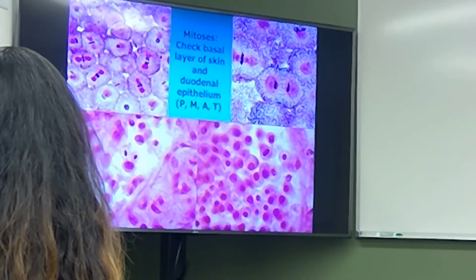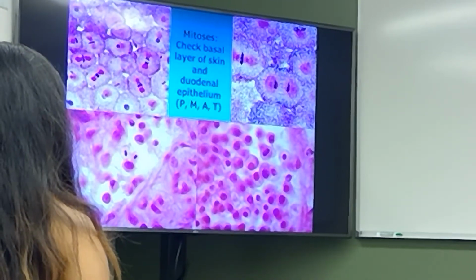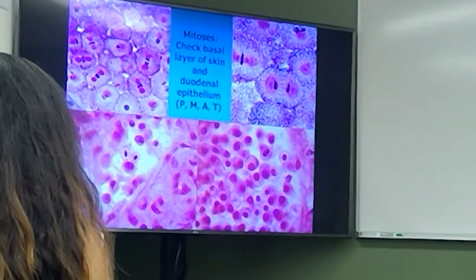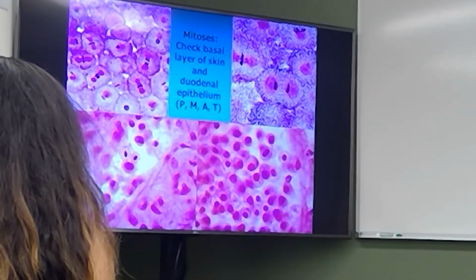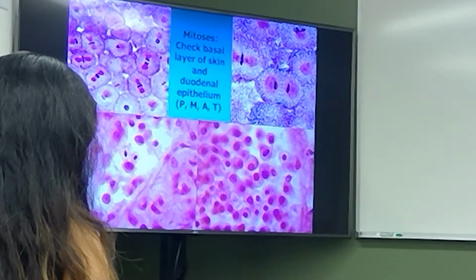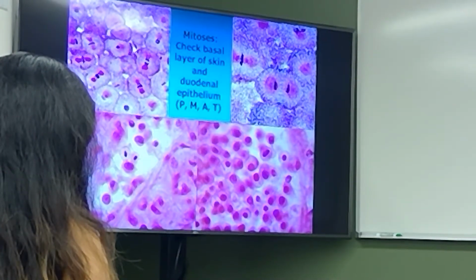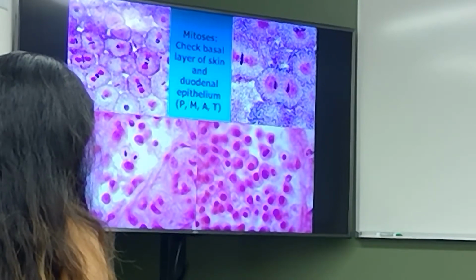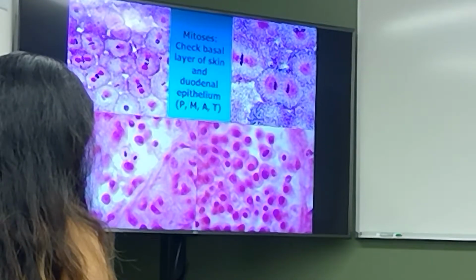I mean the technique. So the technique is laser capture microdissection. It's essentially a microscope with a special laser on it that will allow you to lift cells off the slide so that you can put them into a tube. They'll be on the surface of the cap of the tube, and then you can extract proteins or DNA or RNA out of them and analyze it. That's the tubes.